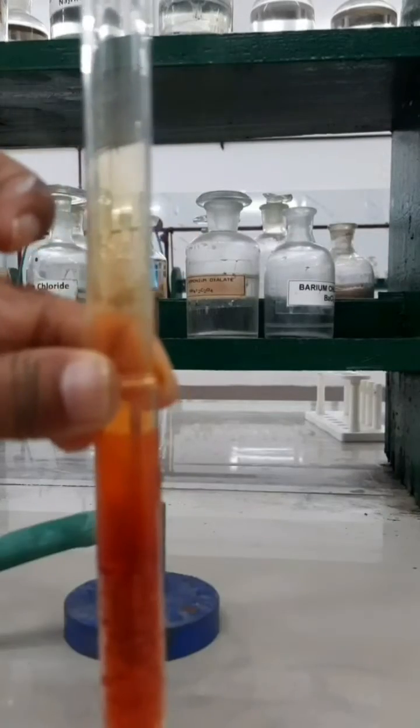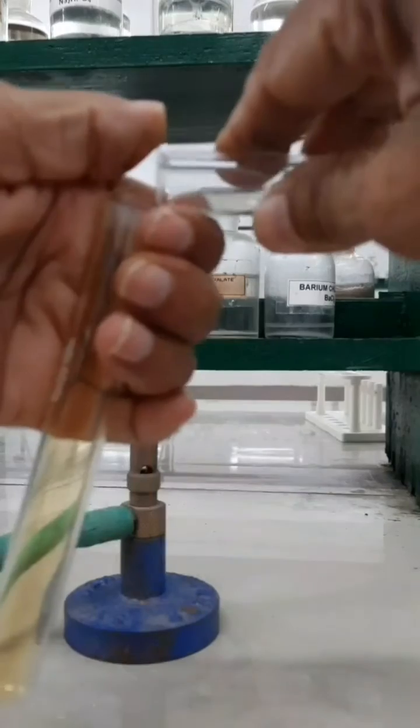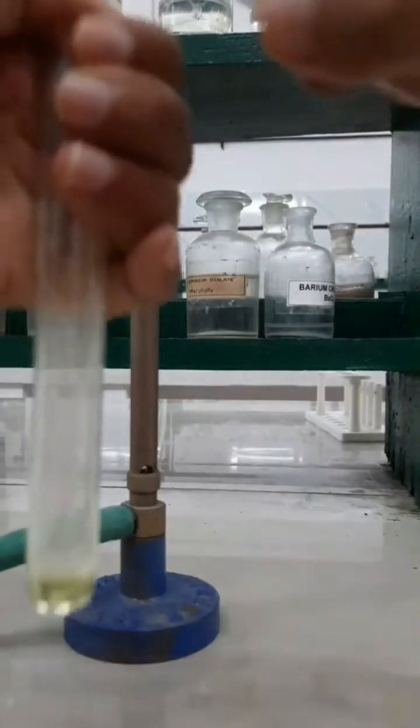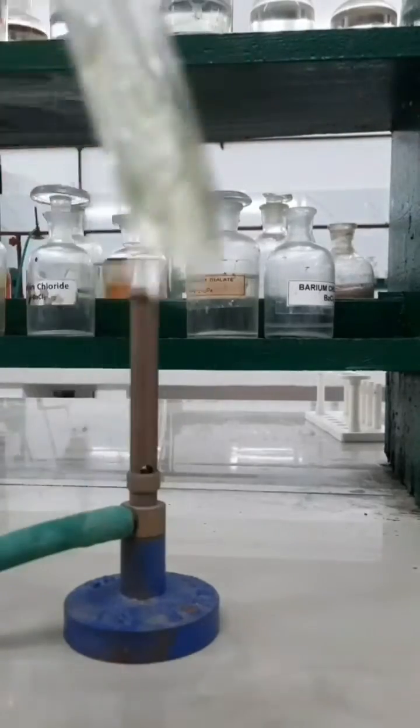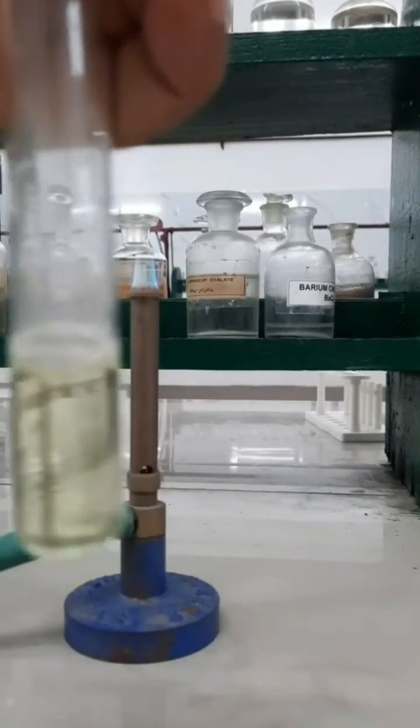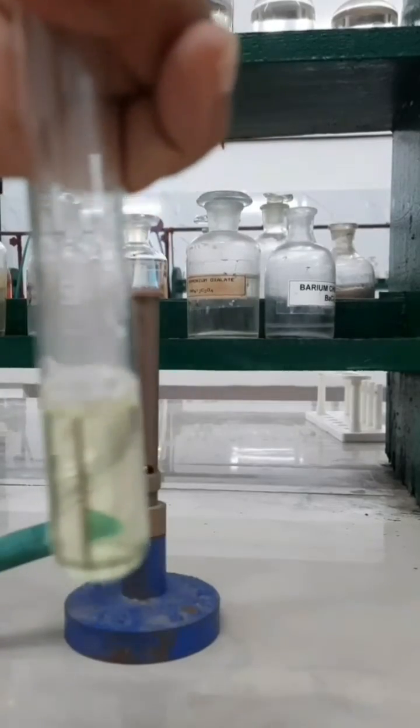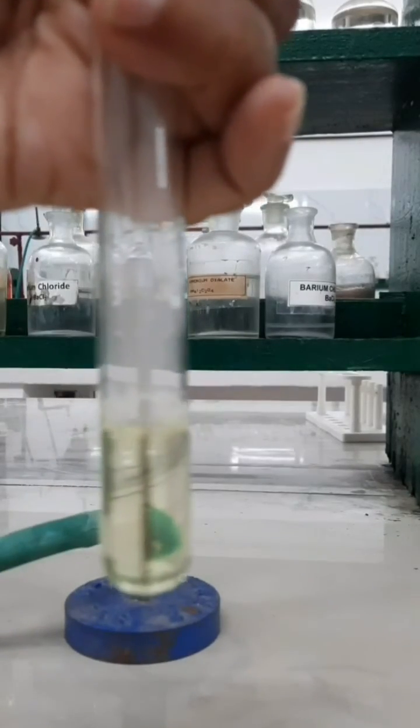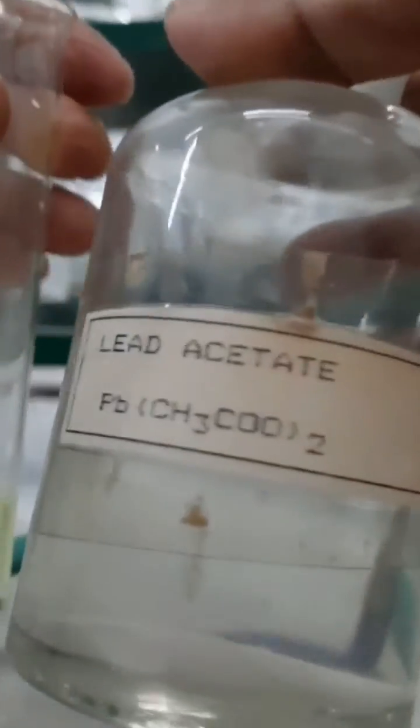Collect the vapor by placing an inverted test tube over the first one. Remove the test tube and then add sodium hydroxide solution into it and shake it properly. A light yellow solution of sodium chromate will be obtained.